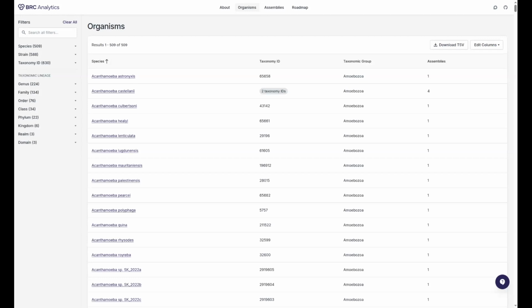So for a given species with a specific tax ID, you can have multiple associated genomes. It's also possible, for example, in cases like human, that this is how it evolved. You have multiple versions of the same genome, which reflect different stages of evolution of sequencing technologies and so on.